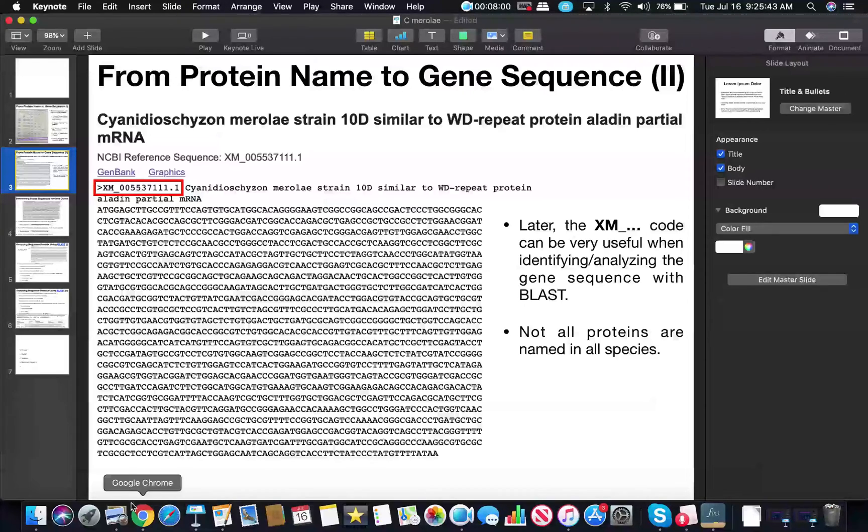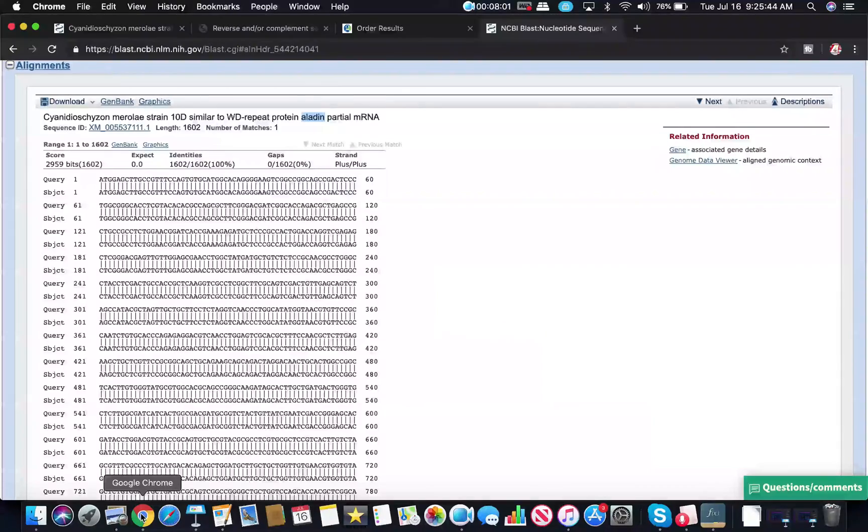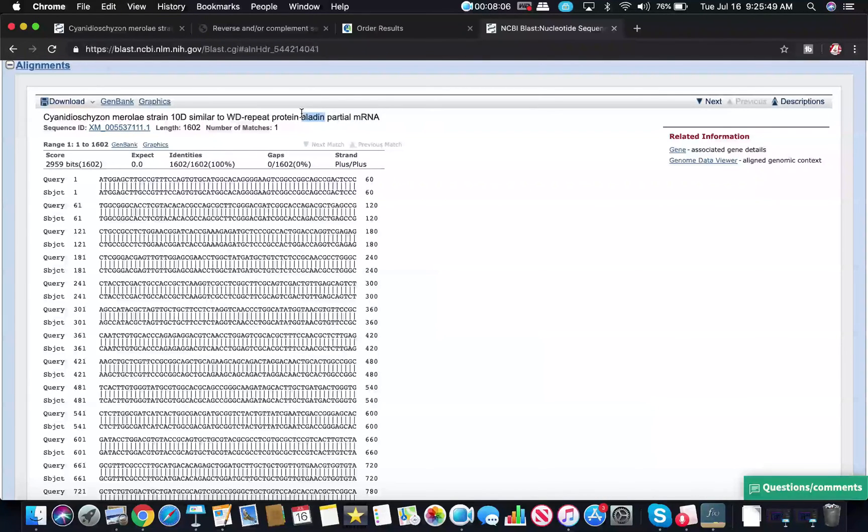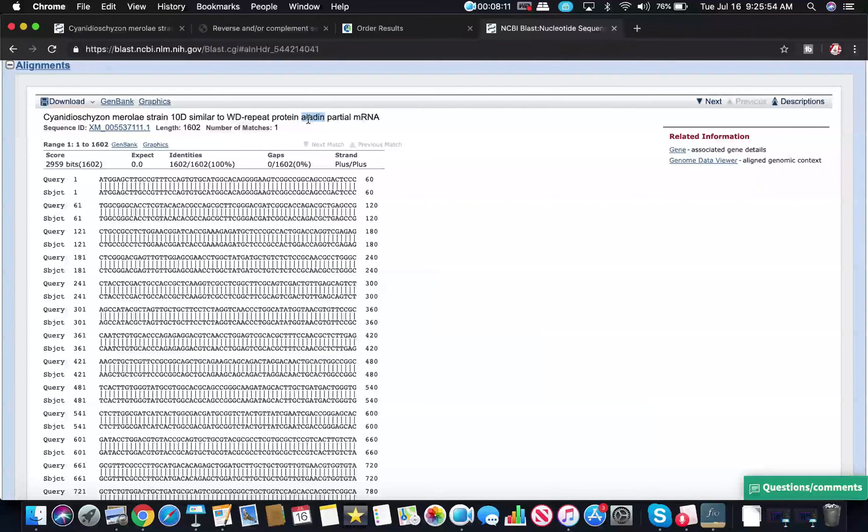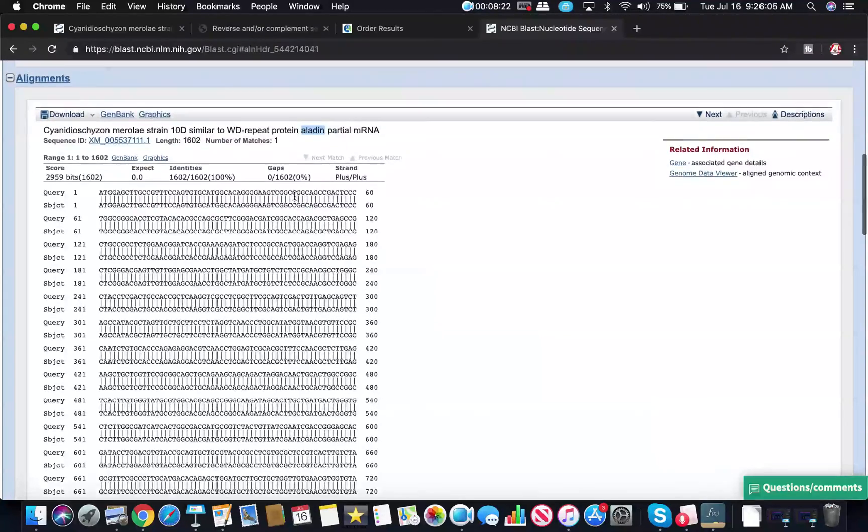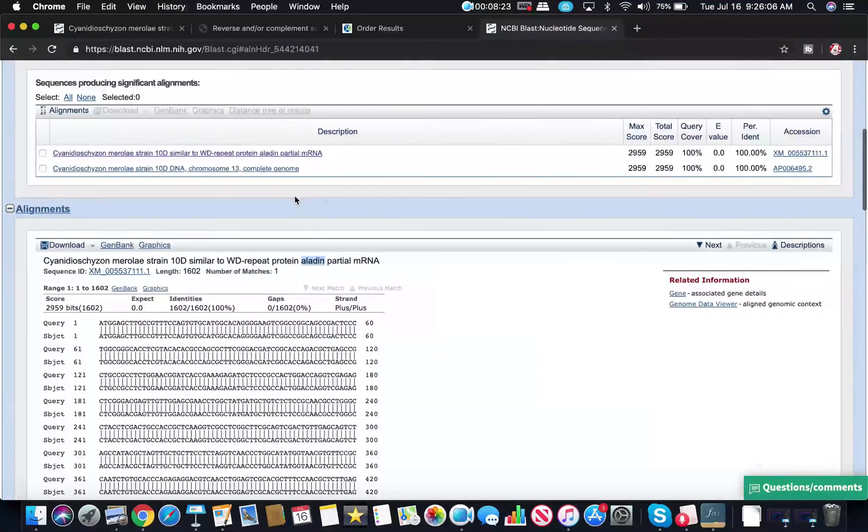If we go back here, we see that it has the exact same XM number. So even if this did not say Aladdin on it, we would still be able to identify it as a perfect match because it has this XM identifier. So that's very important. There's some other things that you can also look for to help you identify it if that's not enough.